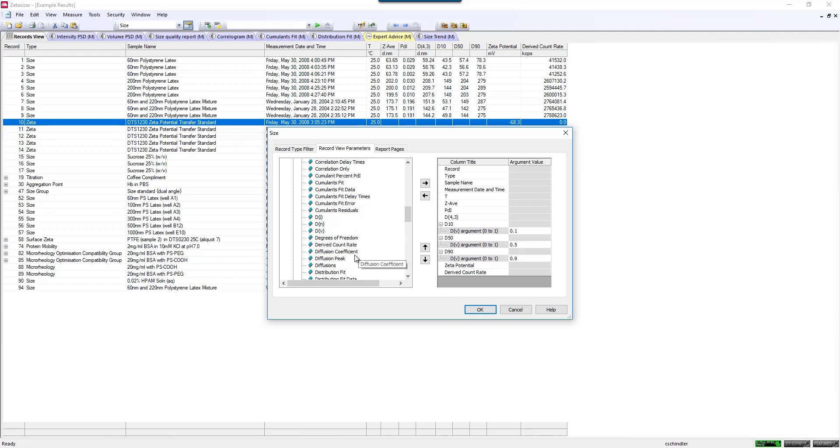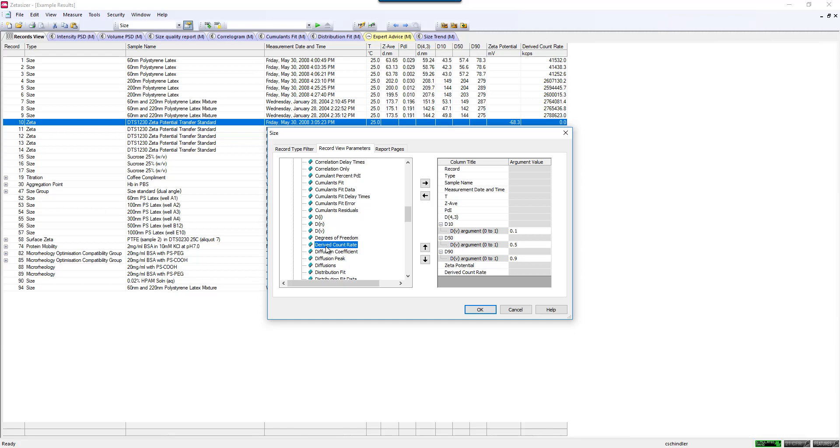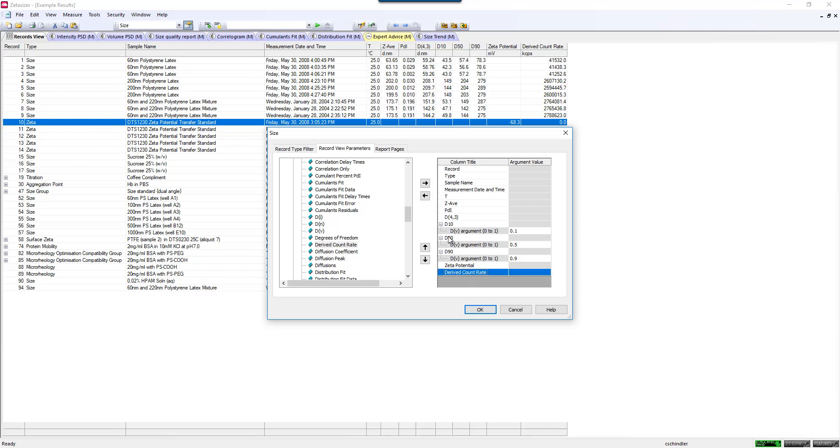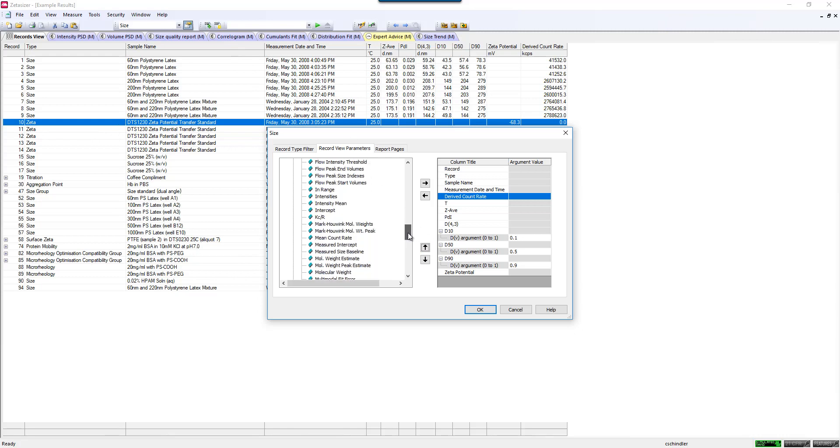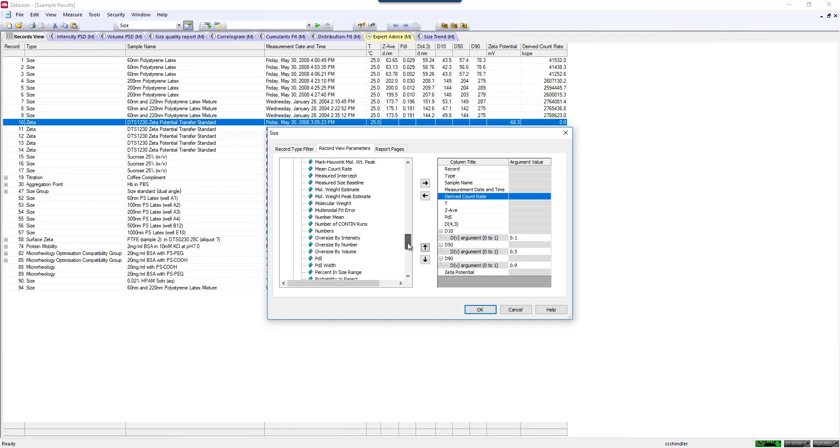To get these values to display, let's say I want to display my derived count rate, which is basically the overall intensity of scattering from my sample with the attenuator taken into account. If I want to add this, I just pop it over here. You see I already have one of those over there. Pop it over to this list, and then I can select where I would like to see that in my parameter list. Maybe this is really important to me, so I want to look at that first and have that be the first thing displayed.